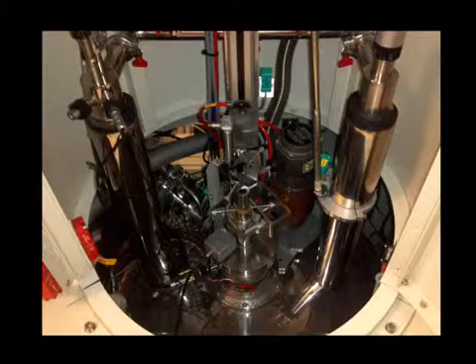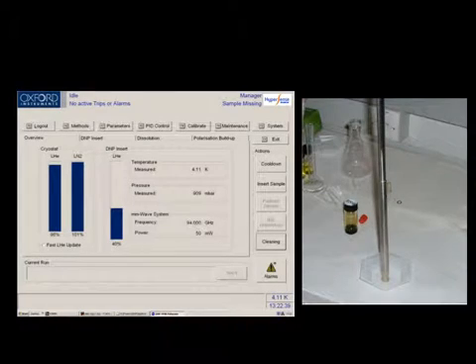So when you click Insert Sample on the main, well, I'm skipping ahead here. Let's go back to this screen. After we've hit cool down and this level's coming up, while it's cooling down, it's a good time to take out this other stick, which is the loading stick. This is where we take our Hypersense sample cup, which we've loaded with our mixture, which has our C13 labeled agent, our radical, and maybe some gadolinium, as we talked about. And we load this onto this sample stick apparatus.